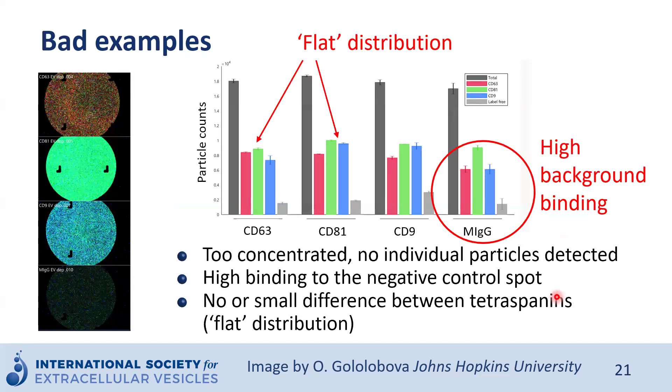One example that is not so good — it may look prettier because there are lots of colors — but if we look especially at the CD81 spot, the colors all mix together and we cannot clearly see individual dots for each spot. Furthermore, the signal on the mouse IgG spot is comparable to the signal on each specific antibody capture spot, which is concerning. We also see a very flat distribution with little difference between tetraspanins, which is usually not the case for most extracellular vesicles.